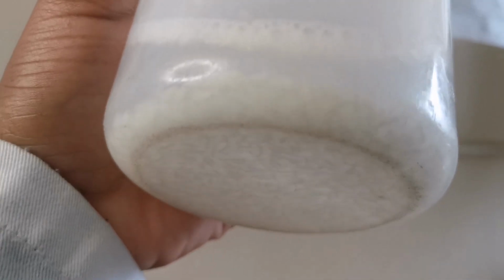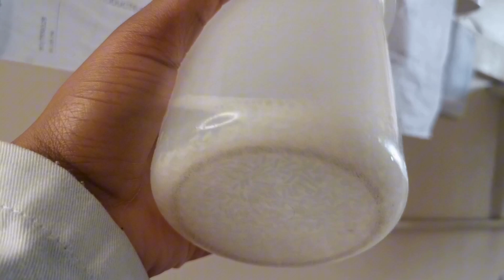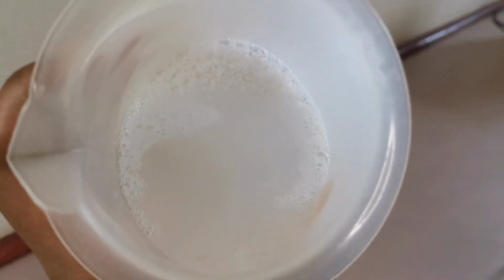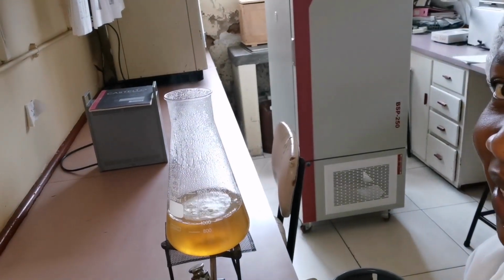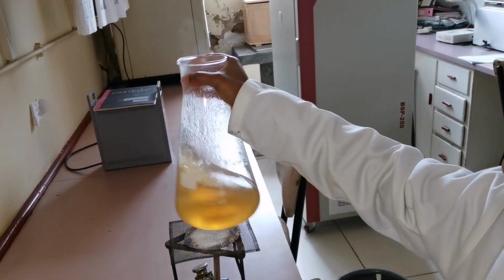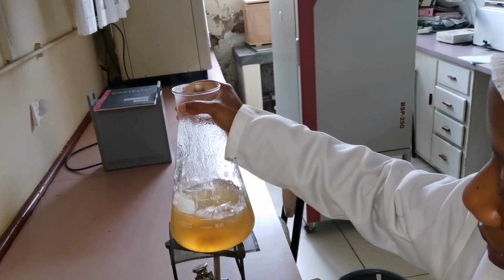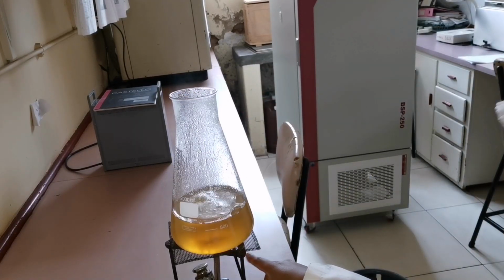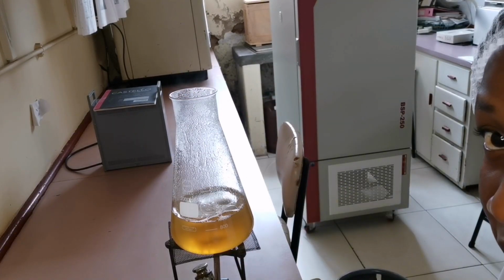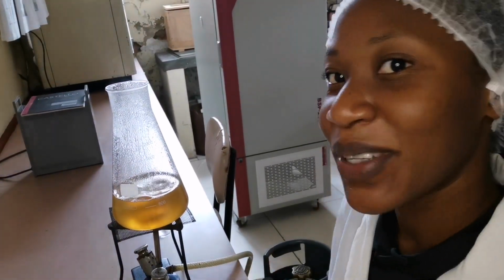Moments later. So far, this is how the Ekoprim is looking. It's not completely dissolved, as you can see. Now it's officially done. It has completely dissolved. And the easiest way I can tell is because of this circle that forms at the center. Can you see? That's one way you can see that it has completely dissolved.